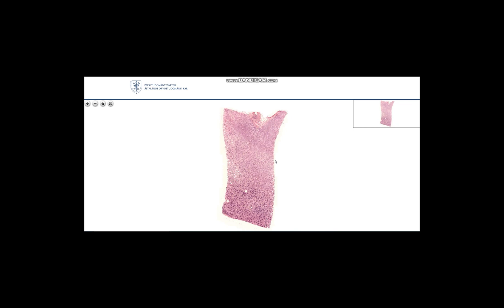In this slide we will see simple squamous and simple cuboidal epithelium. The tissue comes from the kidney medulla — commonly we call it the kidney papilla. It is stained with H&E: H stands for hematoxylin, E stands for eosin. Hematoxylin stains the nuclei of the cells.